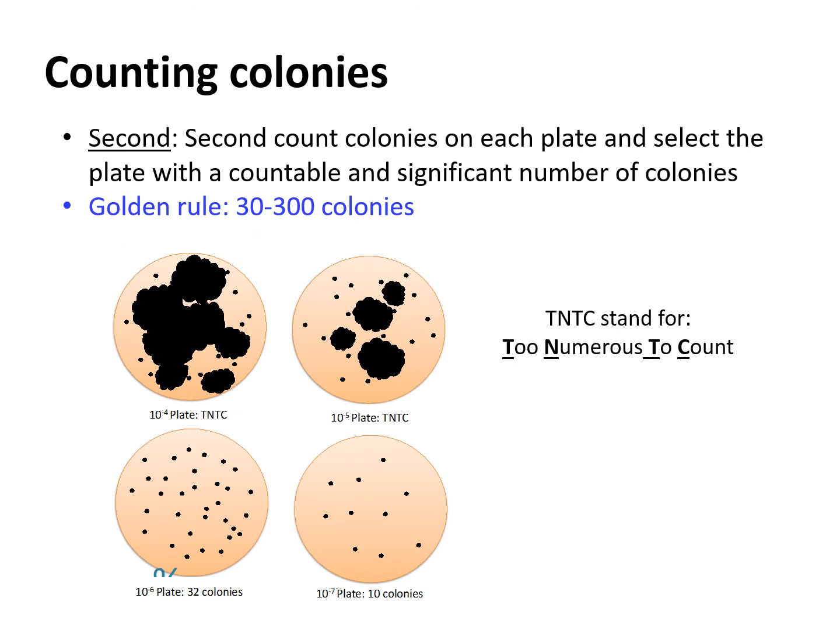So that's what we do first, right? All of what I've explained so far is usually what we do first. We get our original sample, we perform our serial dilutions, and after you are done with your serial dilutions, you take a sample, either 1 mL or 0.1 mL from your dilutions, and you plate it. Then you put your plates in the incubator 24 to 48 hours so that you can start culturing your bacteria. After 48 hours, you grab your plates, take a look at them, and start counting your colonies.